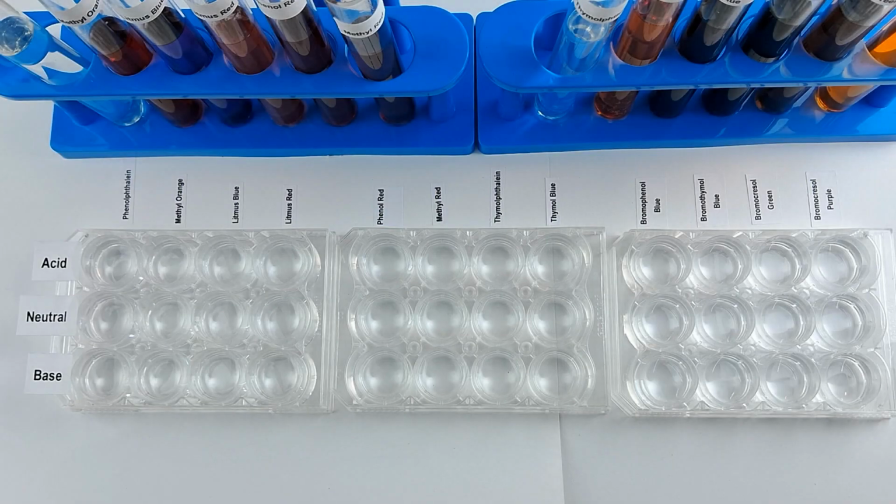Next, we arrange 3-row cell culture plates or microplates with as many wells as the number of indicators to be tested. We label the 3 rows as acid, neutral, and base. We also label the columns with the names of the indicators to be tested as shown here. The 3 rows are filled with a few milliliters of a dilute acid, a pH 7 buffer solution, and a dilute base respectively. For a better visual effect, I have used cell culture plates. You may also use several test tubes instead.